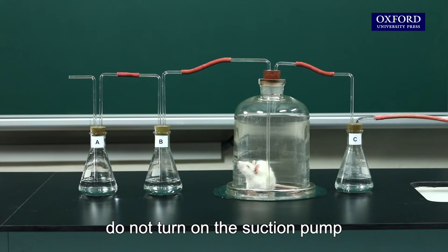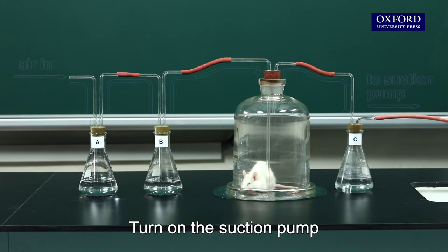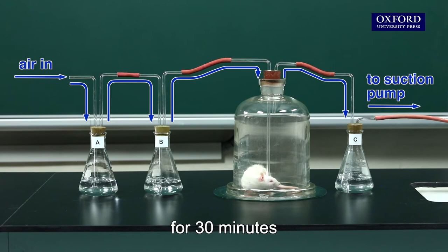After setting up the apparatus, do not turn on the suction pump. Note the colors of the solutions in the flasks. Then turn on the suction pump to draw a stream of air through the apparatus for 30 minutes.